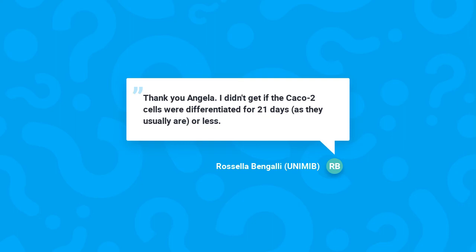Yes, they are differentiated for 21 days.